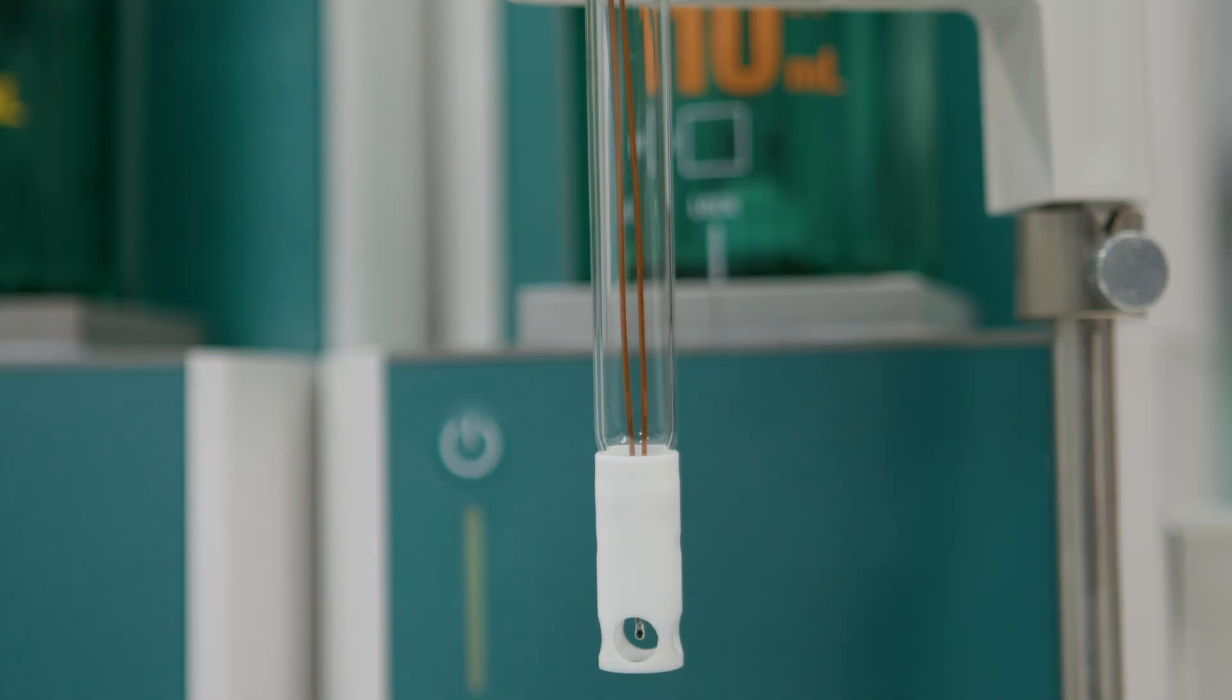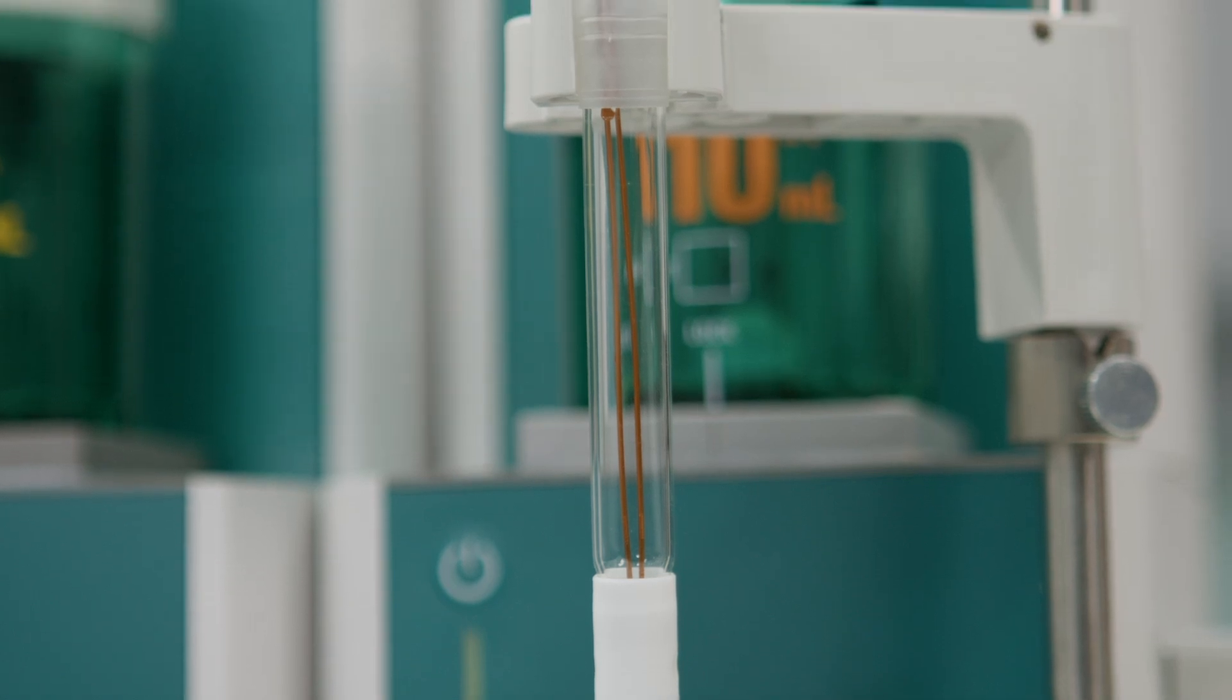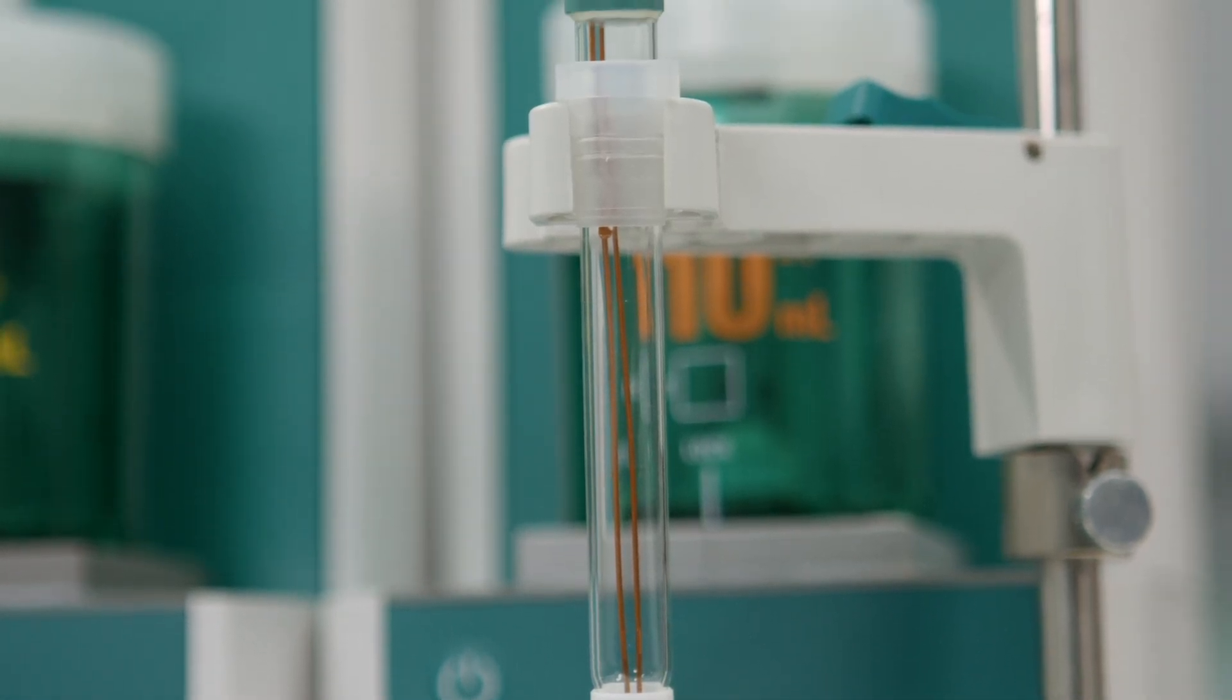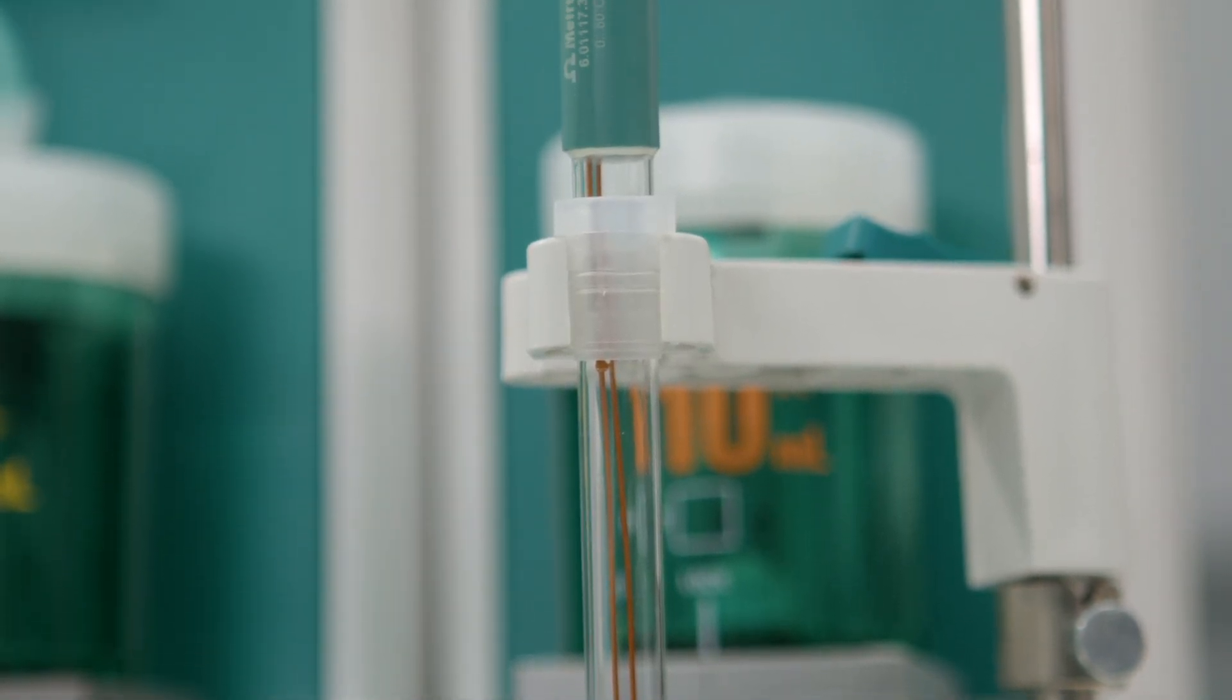The D-thermoprobe is maintenance-free. Calibration and conditioning are also not required when using this sensor.